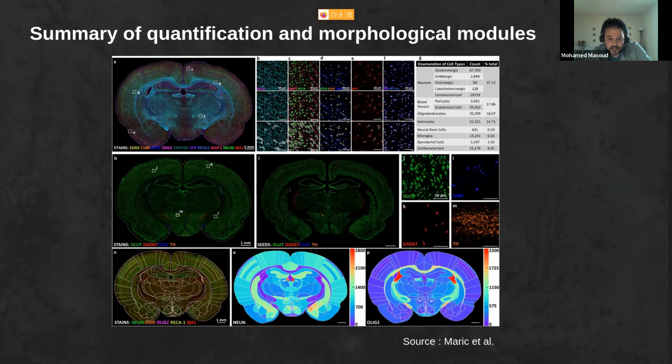So in general, the authors in this paper put together a protocol that can work if we want to bring multiplexing imaging technology to the brain.